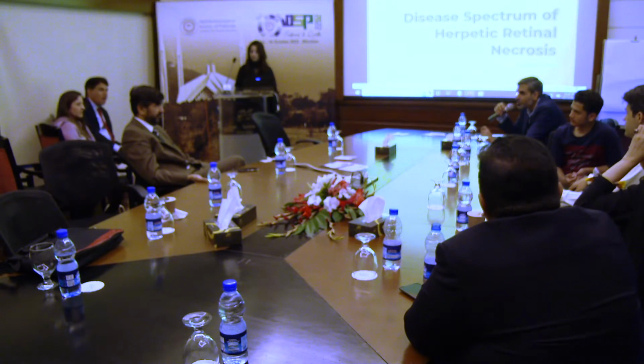Can I ask you one thing? The software which you used, ImageJ, that you mentioned, the marker you were using for the oil droplets, my impression is oil droplets should be in a spherical, circular form. It was coming up as quite linear. The dots don't appear in circular form. In all the images we have taken, none are circular. Do you think they are clumps, multiplied clumps?